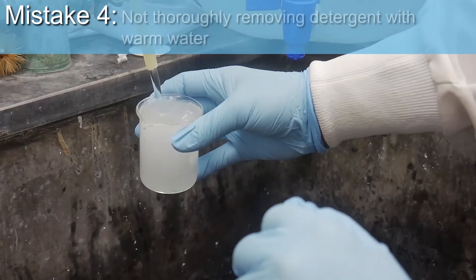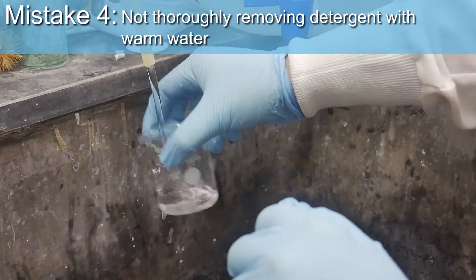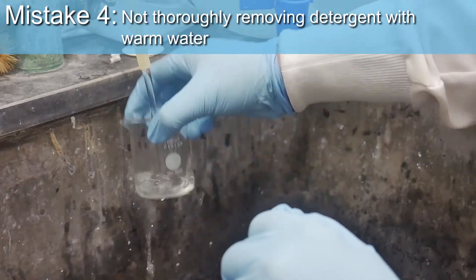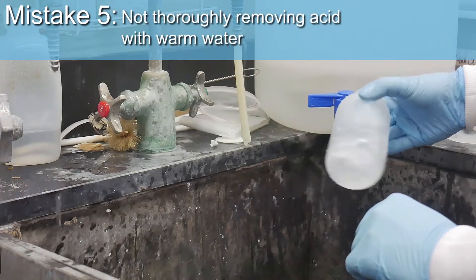Mistake 4: not thoroughly removing detergent with warm water. Mistake 5: not thoroughly removing acid with warm water.